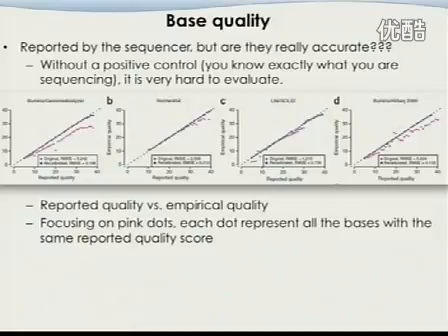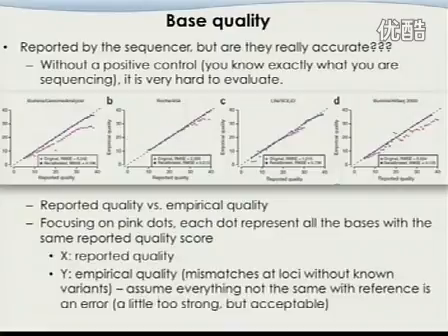Illumina lied. The theoretical value should be very close to this diagonal, close to 45 degrees, but Illumina really lied. And 454 is doing okay, and SOLiD is doing okay. For Illumina HiSeq 2000, the same issue showed up.